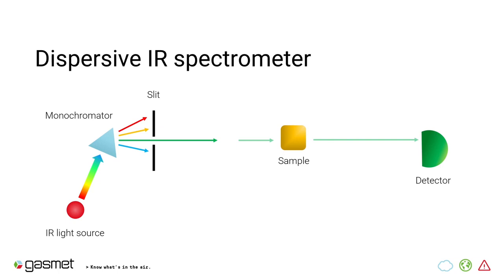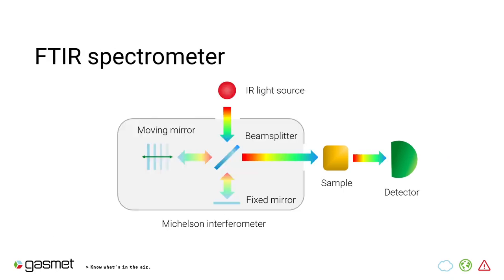One way is a so-called single beam operation. Here we first measure an empty sample cell to get a comparison measurement. This is called reference or background. Then we insert the sample and measure. We can also use a so-called double beam operation. Here, a device known as beam splitter is used to send half of light through the sample and half through an empty route as a reference. And after light goes to the detector, it would then compare the two signals and see if any absorption had happened in the sample.